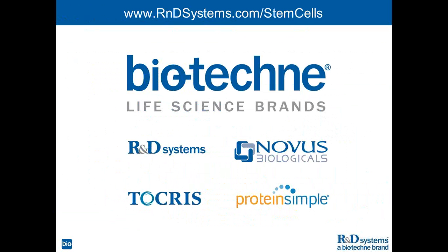There's a question here about the differentiation protocol. Is there a difference in the protocol that you'd use between an embryonic stem cell and an induced pluripotent stem cell? No. So the protocols that we use, you may see some differences depending on the cell line, but that could be differences between different embryonic stem cell lines as well as different iPS lines.